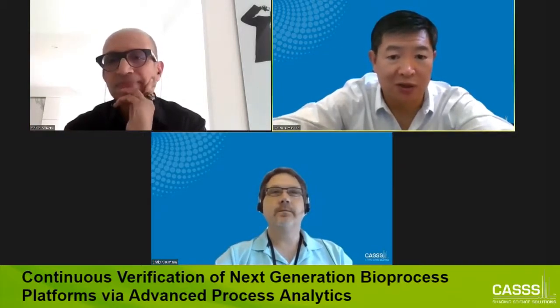Thank you. Great. Well, we are waiting for the other questions to come up. I have a question about the multivariate analysis work you have done. It looks very impressive, the software prediction. My question is, do you drill down to those measurement attributes that cause the process variation and then look into the root cause of that, maybe from the biology point of view?